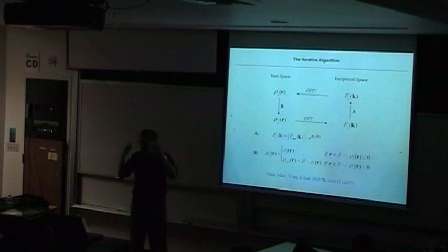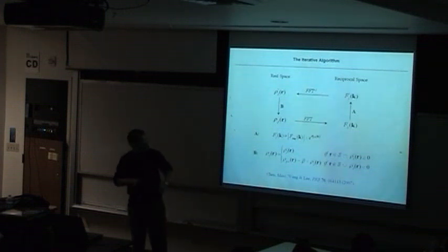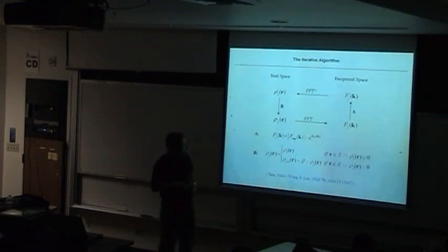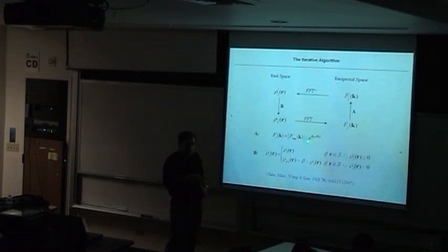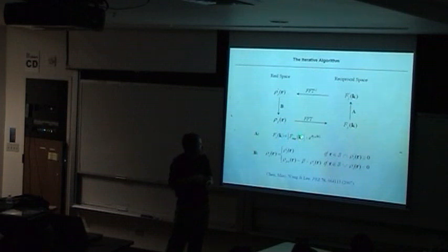I assume I already convinced you that if you oversample the diffraction pattern, there is unique phase information encoded inside the diffraction intensity. But the next question: how to reconstruct it? So we use an iterative algorithm, modified from the original developed by Gerchberg, Saxton, and Fienup. And we have a recent version, I think it's a little better than the previous one. We start on the computer. We generate a random phase angle. We don't need any model. It's model free. Combined with measured data, we get this Fourier transform, and with the inverse Fourier transform, we get electron density.